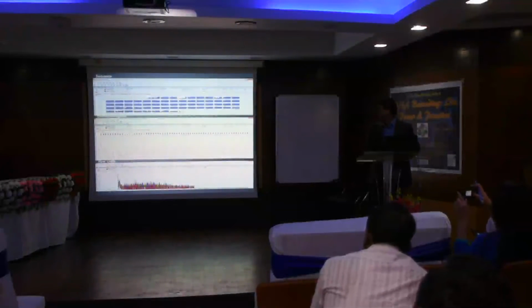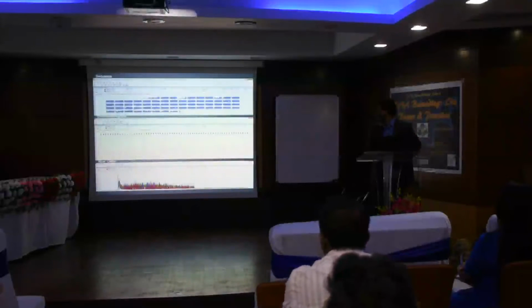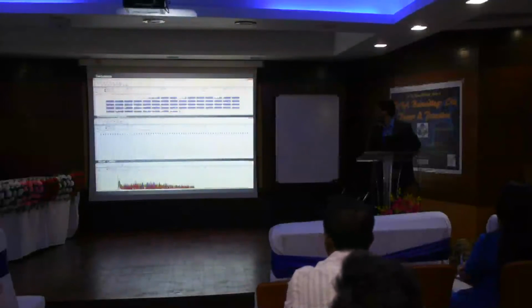And your electropherogram will reflect in this way. Perfect peaks, no overlapping. And here no laboratory, no expert in the world will object or question your work. And your original electropherogram image will be like this. Perfect. So insist on such type of things. Here the QC value is good. You can see somewhere the QC value might have been mentioned here. So this is a good condition.